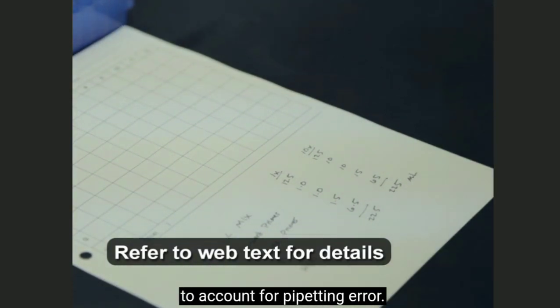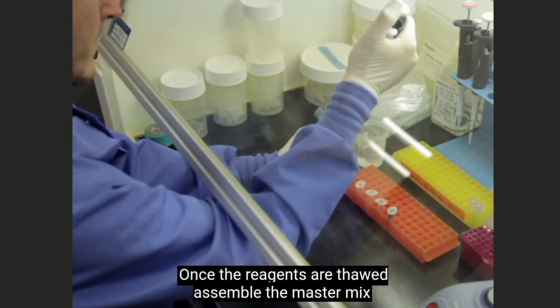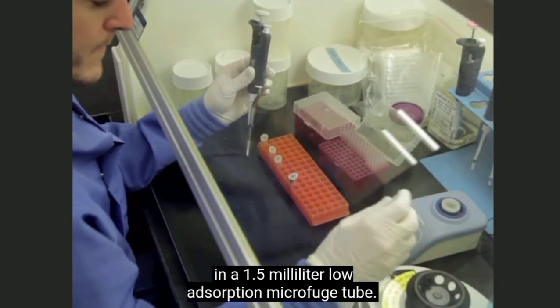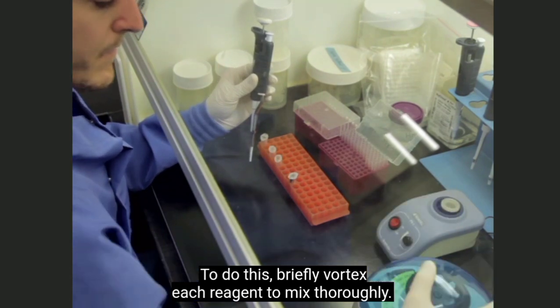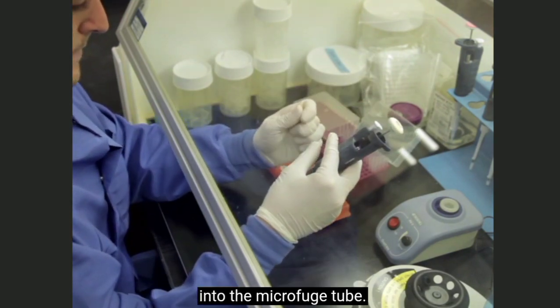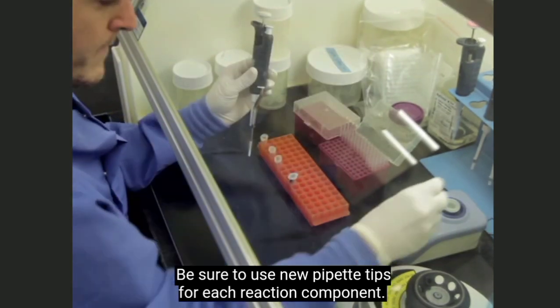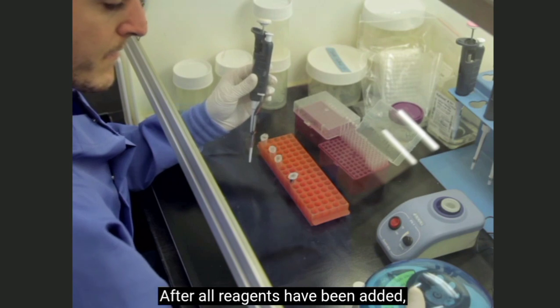for pipetting error. Once the reagents are thawed, assemble the master mix in a 1.5 milliliter low adsorption microfuge tube. To do this, briefly vortex each reagent to mix thoroughly. Collect any liquid on the side of the tubes using a mini centrifuge, and pipette the reagent into the microfuge tube. Be sure to use new pipette tips for each reaction component. After all reagents have been added, vortex to mix and centrifuge.